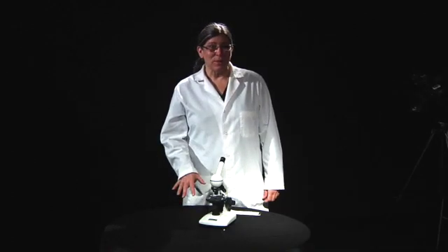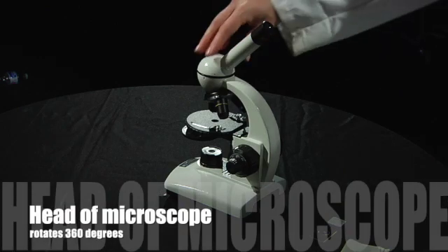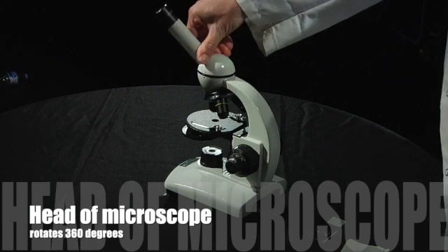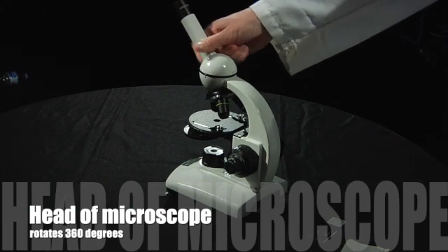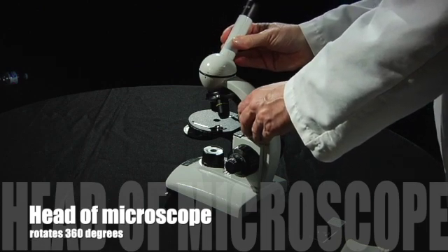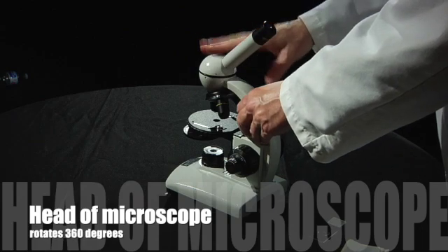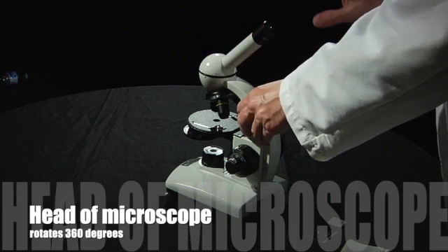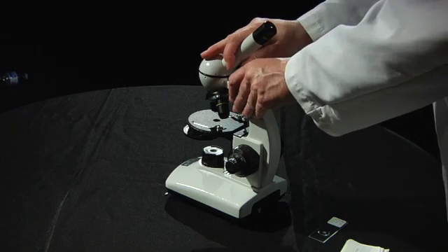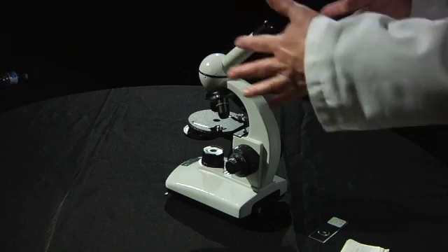The next part of the microscope that we're going to learn is called the head. Most microscopes we don't talk too much about the head, but on this one it's really interesting because the head rotates 360 degrees all the way around so that you could show somebody what you're looking at. You can just turn the head and show them, but do be aware that when you're using the microscope it's best to have it in line with the rest of the body.